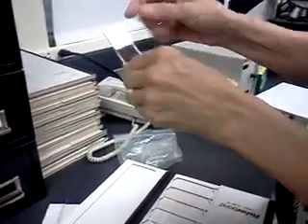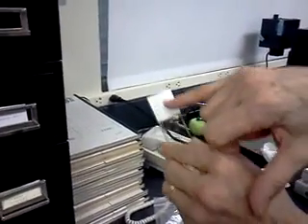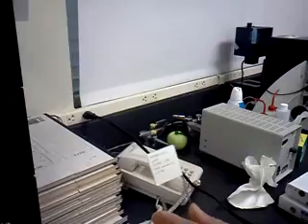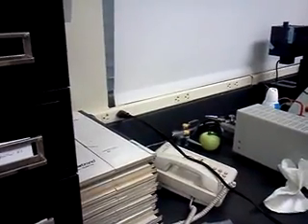The other thing we buy are these labels. In the old days, we didn't have them, but you can buy these. They're little computer-printed labels. And so you can see there's that system, RPNRA1051, spring 04, gap 43, at a 1-900 dilution detected with DAB on 62706. It's all on there. But if you don't keep up with it, then they look like this, which means we didn't do that. And then we got to go back to the notebook and remember everything, and that's not real helpful.